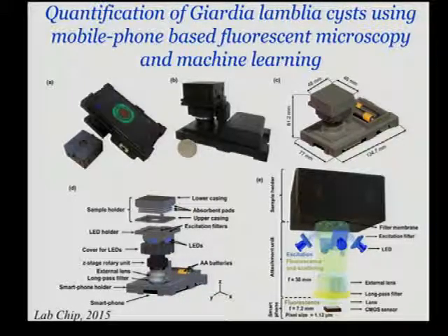This is actually a Giardia detector that's working based on fluorescence microscopy. It's the same idea. Basically, you have a fluorescence microscope there, but you also build a cassette that screens large volumes. What you see in this cassette is a microporous membrane. It has about 5 micron pores, which you can pour in 10, 20 milliliters of water.